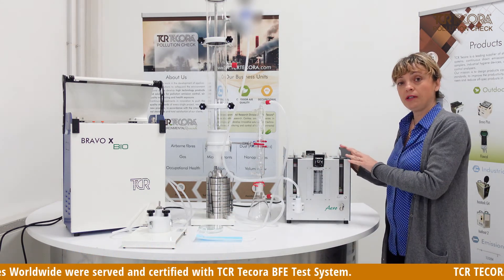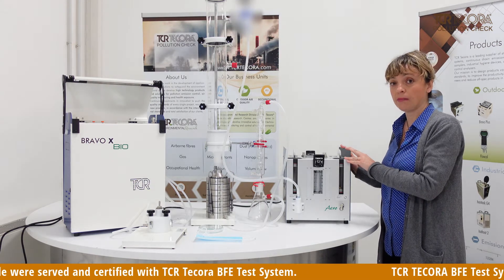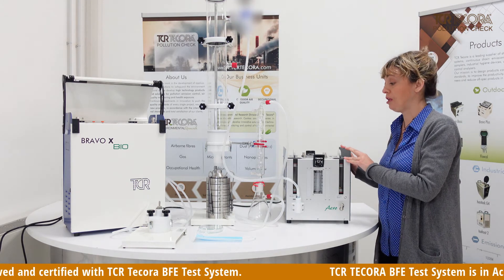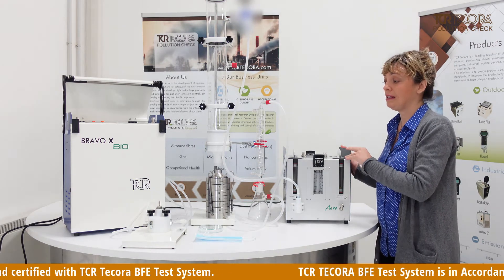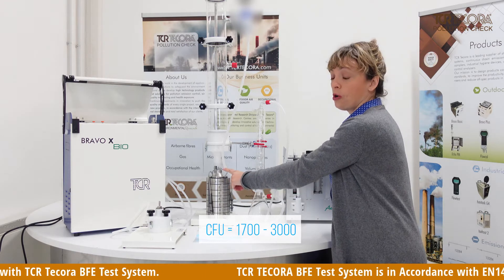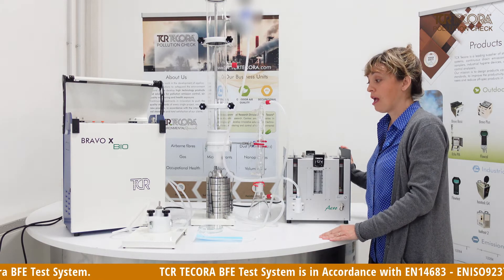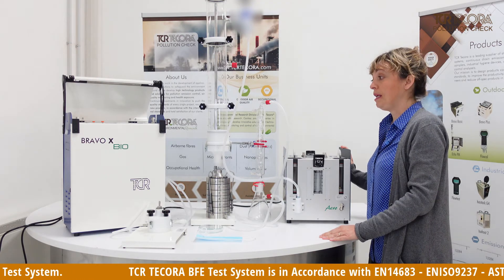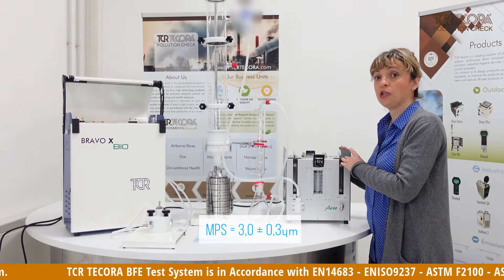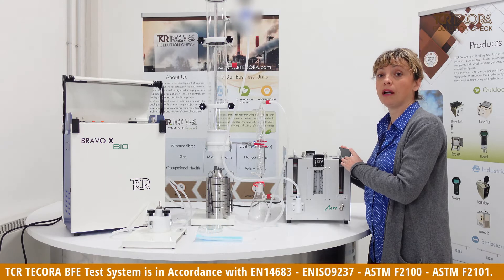The aerosol generator lets you satisfy the requirements of the technical standards for aerosol generation according to the CFU you will count and collect on the multistage viable impactor, as well as the mean particle size required according to the standards, which is 3.0 ± 0.3 micrometers.